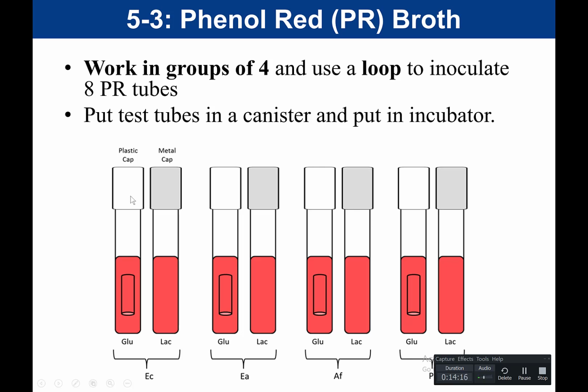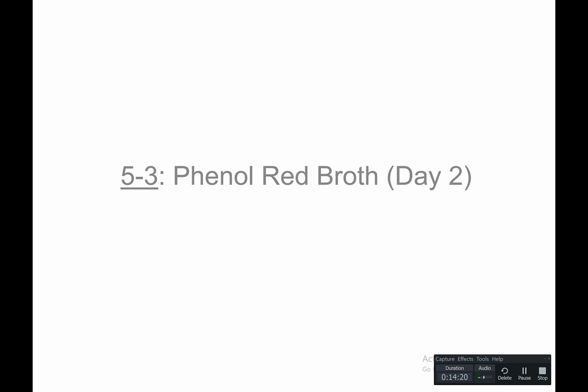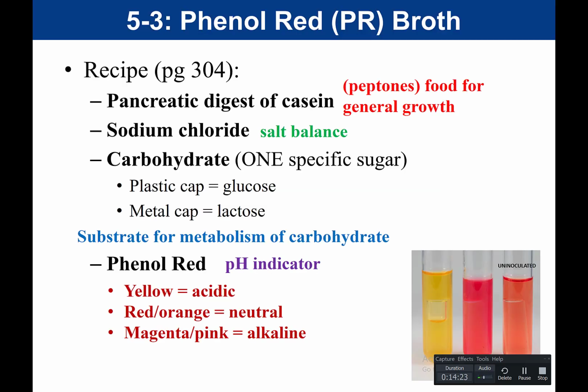That's not important either. So for day 2 of our Phenol Red broth, now when you're studying, students kind of panic about this in terms of, do I need to memorize all of the ingredients in every recipe? And the answer is no. So you do want to understand that in the Phenol Red broth test, there are peptones, and in that media, the peptones are there as food for general growth.